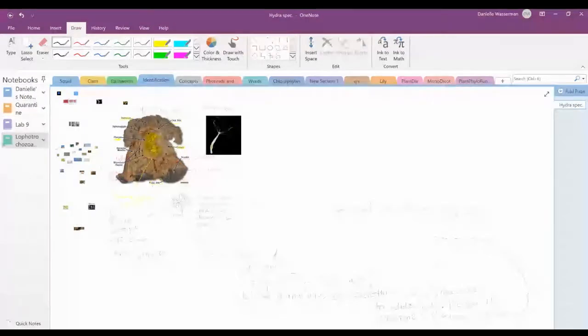See, now I'm going back over here and I'm circling something. Retractor muscles. This is not a very porous thing. The trunk of the anemone is tough. It will sting prey, pull it in, and it has to keep it there. They also need to contract their bodies if they feel threatened. They also move a little bit. Sometimes they'll release their pedal disc. They'll drift. They may contract a little bit along with the drifting. So if it was full of holes and tubes, then it could not have a strong body.